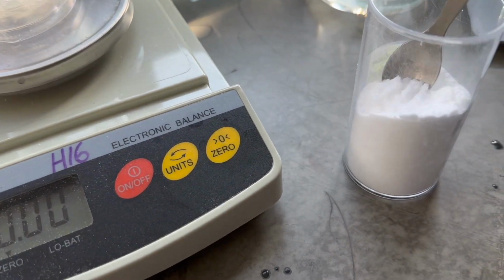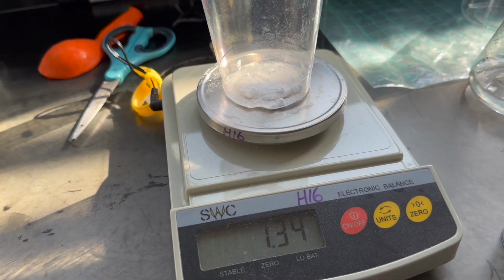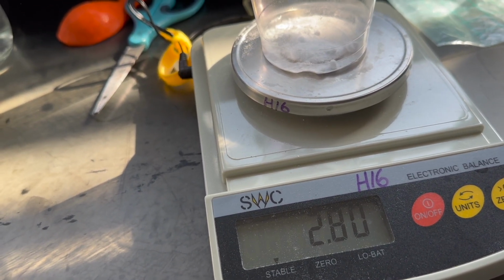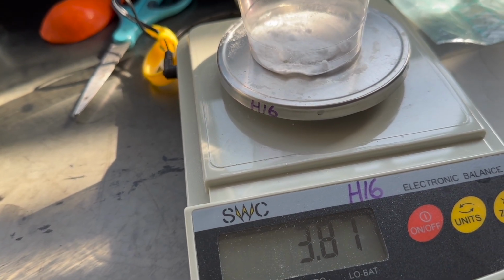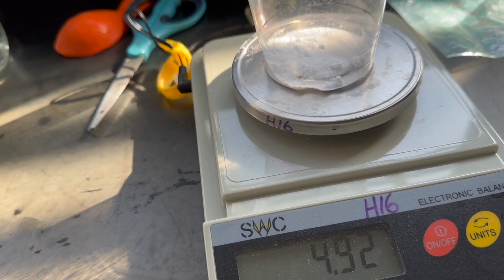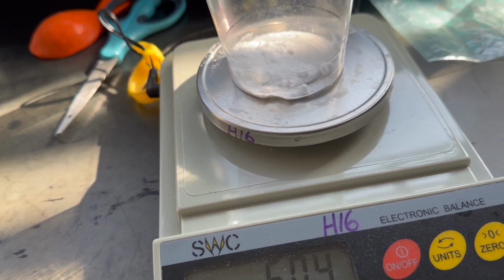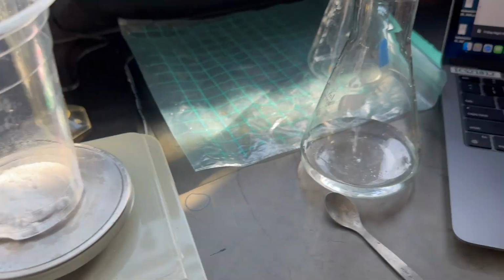Okay, so here's my baking soda, and I'm just going to put some in there until I get to 5. So up to 2.8, almost 3, 3.8. Oh, super close. Okay, I'm going to call that good. We've got 5.04, that's really close.